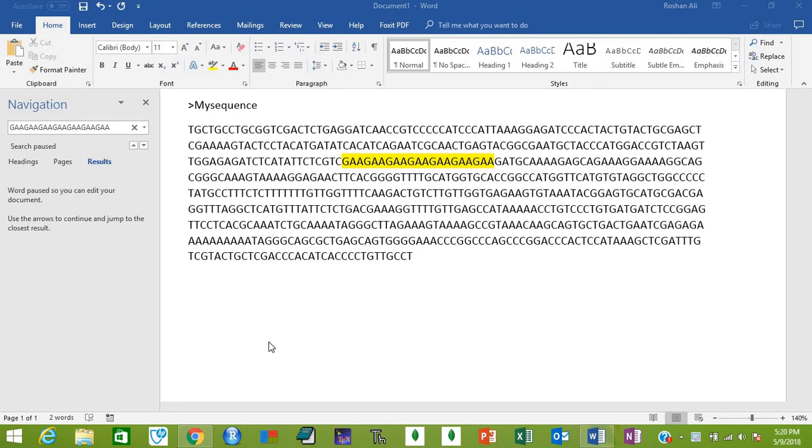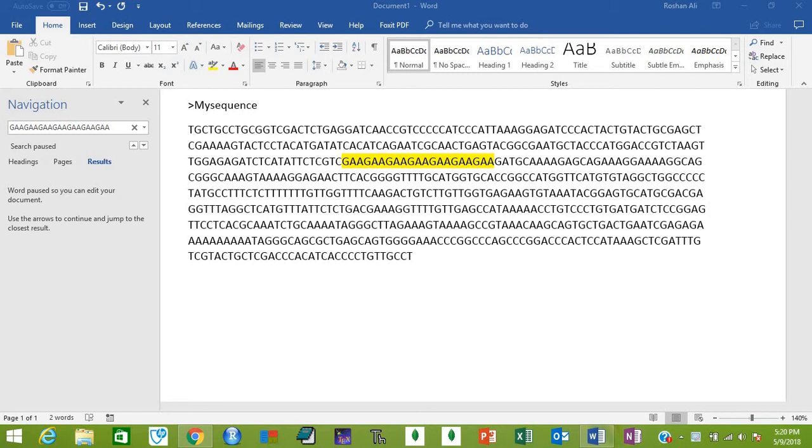As-salamu alaykum. Today I'm going to tell you how to design SSR flanking primers. I already made a video about this, but at that time Batch Primer 3 was not working and I had to make those primers manually. This time I've checked the Batch Primer 3 website and found it working.